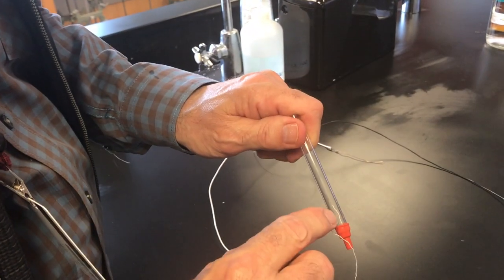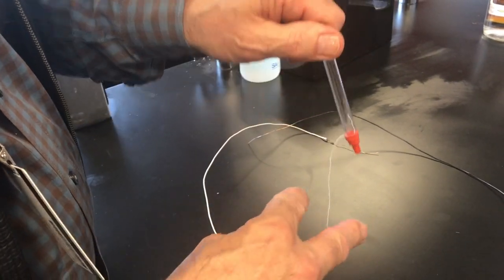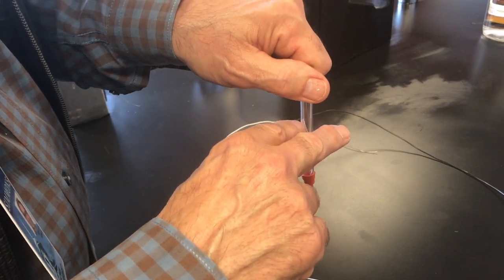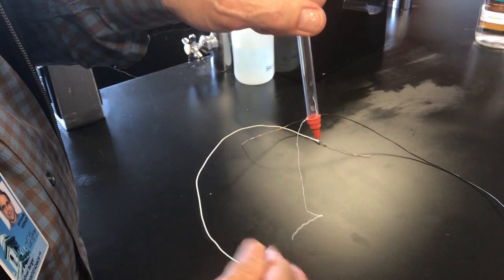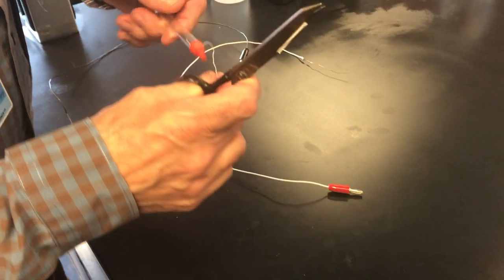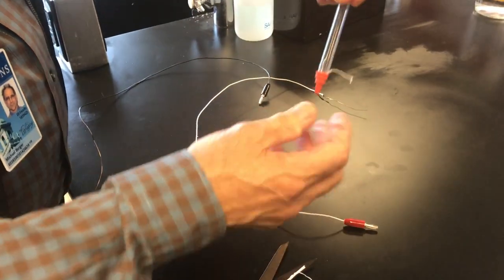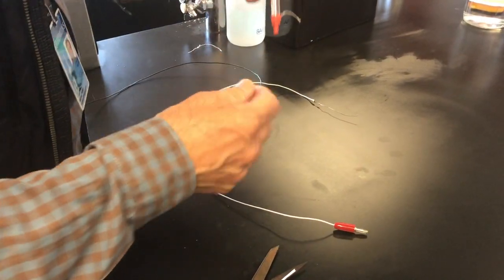Inside you can see we have some of the cotton, which will be conductive, and this is going outside into the solution. Since the chloride solution we're going to be testing is only going to be up to here, we don't need all of this tailing on — so take scissors and cut that off. We just want a little bit here. There's our salt bridge: some of the thread is inside, some of it is outside.